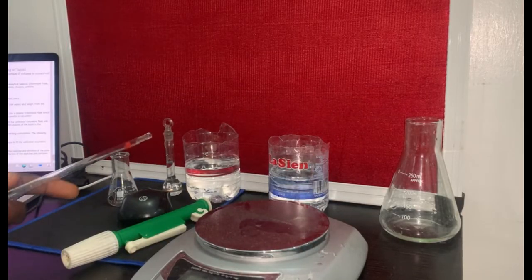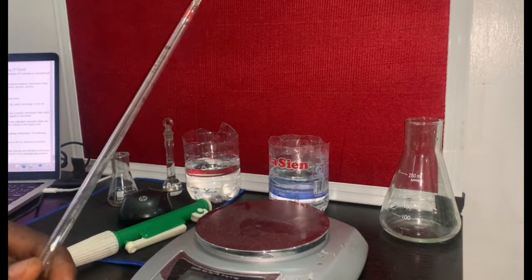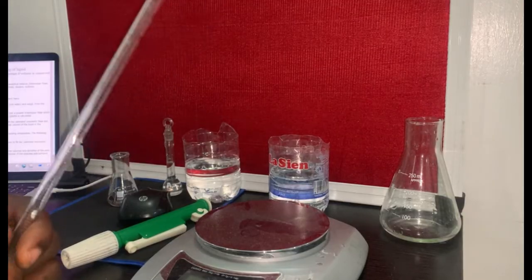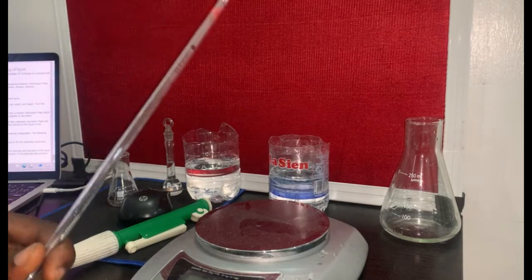Procedure 4 is calibration of transfer pipettes. Now these are transfer pipettes. While we're calibrating all these measuring apparatus, we just want to verify that the volume we were told by the manufacturer is truly the volume this would be delivering. We were told that this flask is 10 mil, so we need to be very sure it's actually 10 mil.